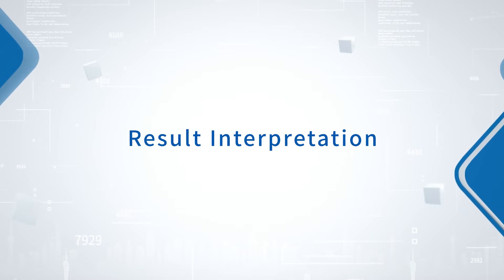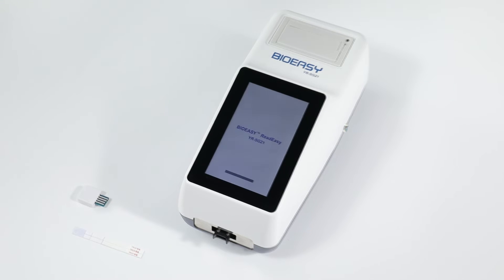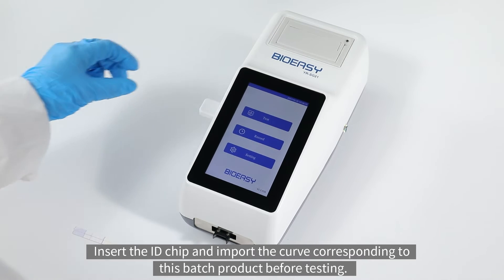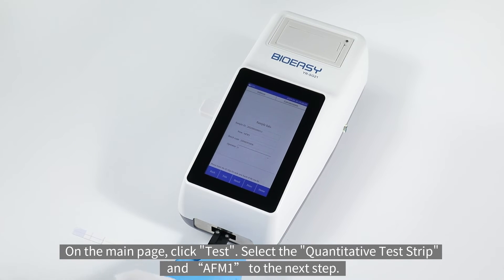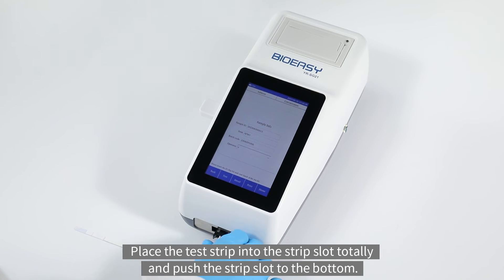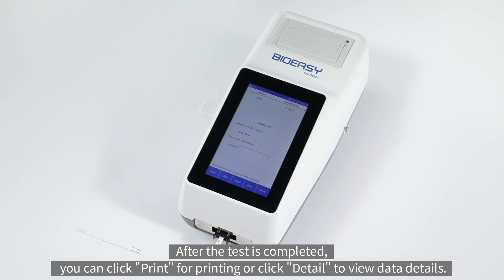Result interpretation: insert the ID chip and import the curve corresponding to this batch product before testing. On the main page, click test, select the quantitative test strip and AFM1, then proceed to the next step. Place the test strip into the strip slot fully and push the strip slot to the bottom. Click test to start. Wait a few seconds — the instrument automatically gives the detection conclusion. After the test is completed, you can click print for printing or click detail to view data details.